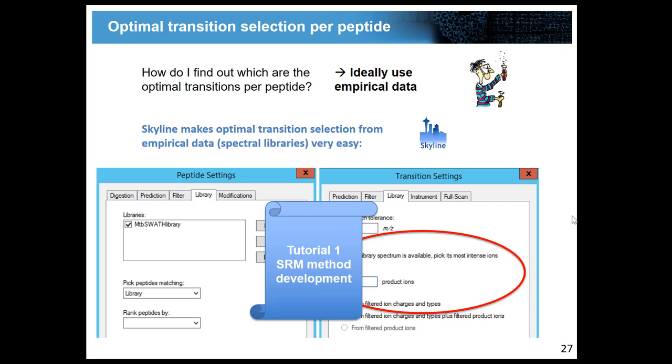If you have proteins that you're particularly interested in, but they do not usually fly very well or are difficult to have a lot of transitions, are those still useful? Well, I'm not 100% sure I know what you're referring to, but for example, what I often have problems with is short peptides. Very short peptides, let's say 5 or 6 amino acids, tend to not be identified in a DDA run, because we often have this minimal 7 amino acids. But they still can be beautifully suitable for targeted proteomics and give very nice peaks. They don't have so many transitions. This is why DDA doesn't identify them.